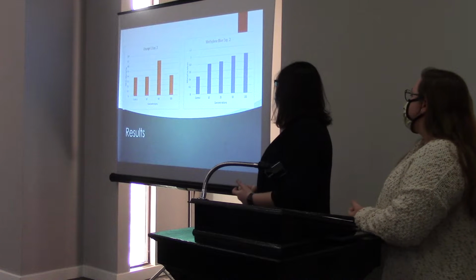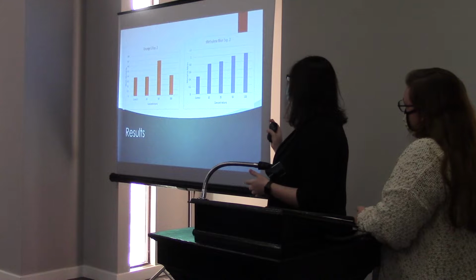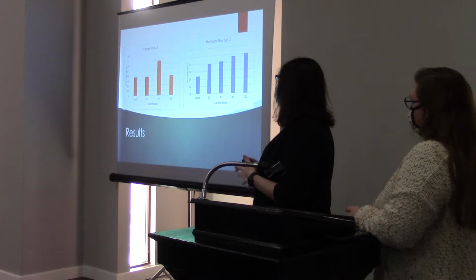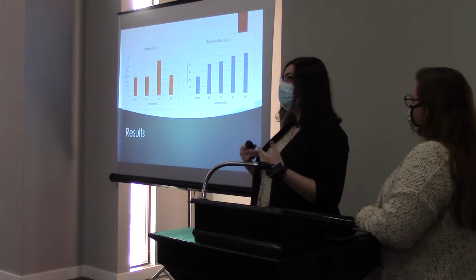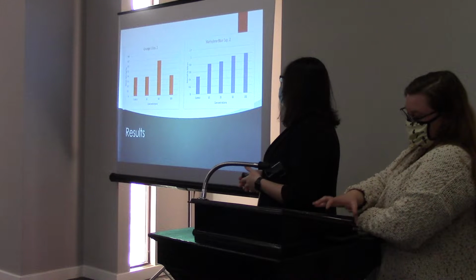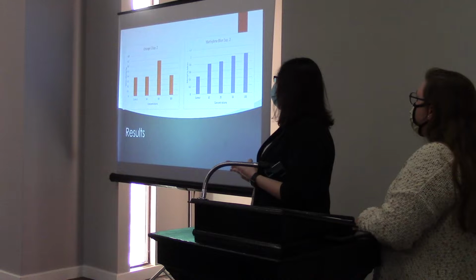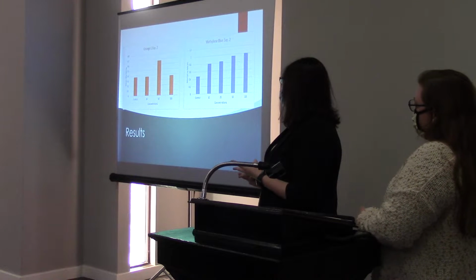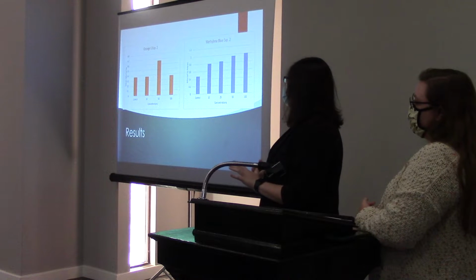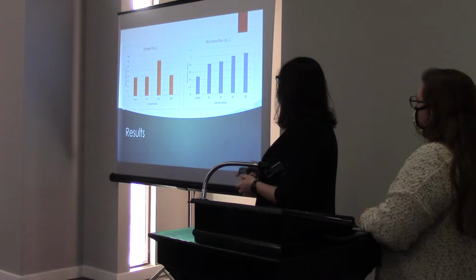So here we have the results of our experimentation. These are the graphs of our second experiment that we did with varying concentrations. Initially, for our first experiment, as a way to just test the waters to see how everything would go, we had both the methylene blue and the orange G start off with our control, 10 milligrams per liter, 25 milligrams per liter, 50 milligrams per liter, and 100 milligrams per liter in concentrations. Then we did the exact same thing for our next experiment.